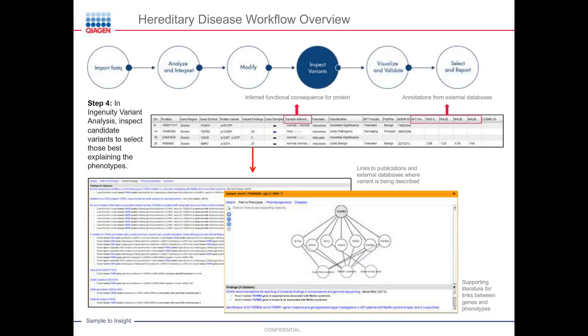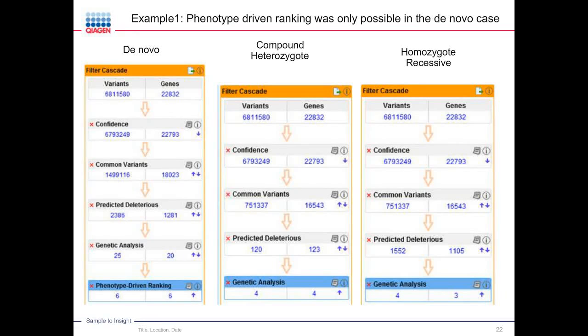So how you come very quickly to your candidate is that in the end you look for all of the different scenarios, and for that, let me go back to the slide here. So here you can see that it runs in parallel all these kinds of scenarios. And you can see that in the worst case, the homozygote recessive case, actually the de novo, you have 25.